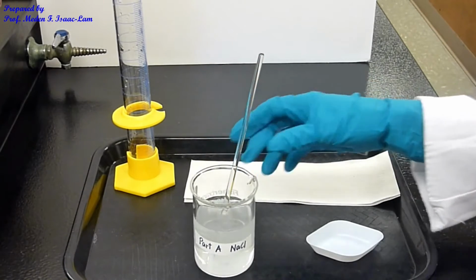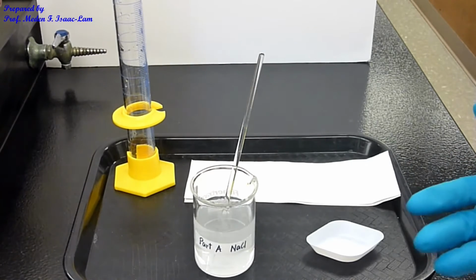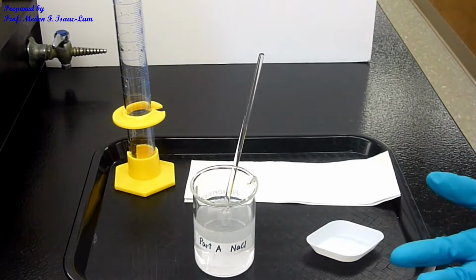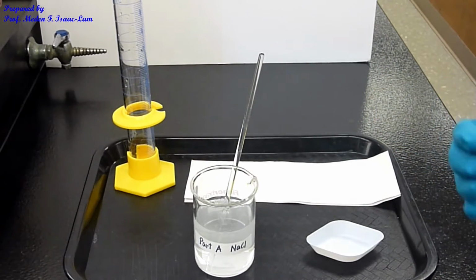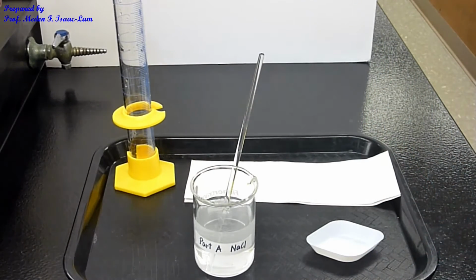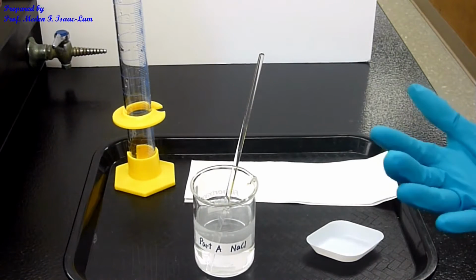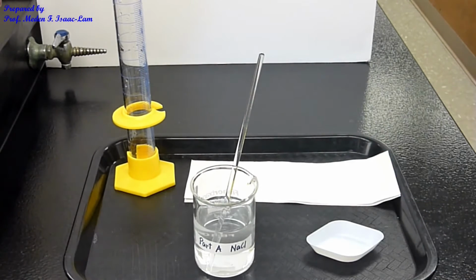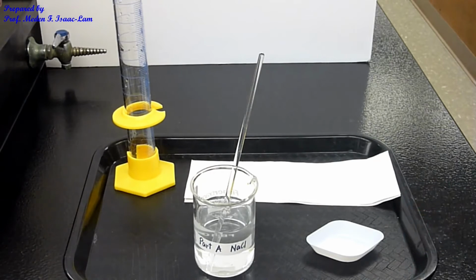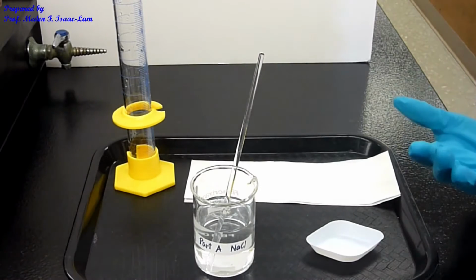A solution is when you put the solute and then the solvent. In this case, the solute is your NaCl, the salt, and the water is the solvent. The bigger quantity is the solvent; the solute is a solid, your water is a liquid. There's going to be an interaction between the salt and the water, that's why it dissolves. Remember that water is polar, and NaCl is an ionic compound. If there's interaction, then the solute will dissolve, in this case NaCl.